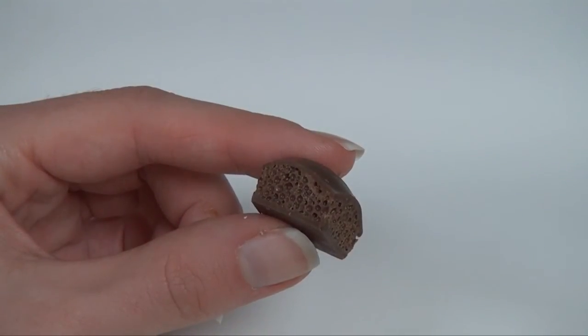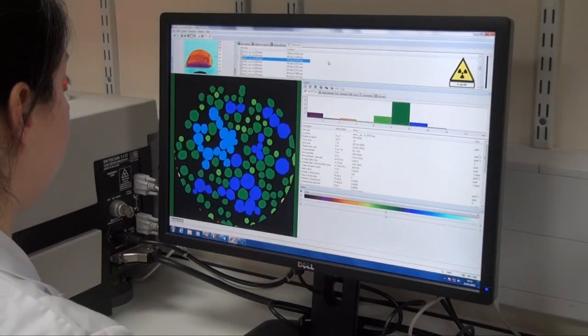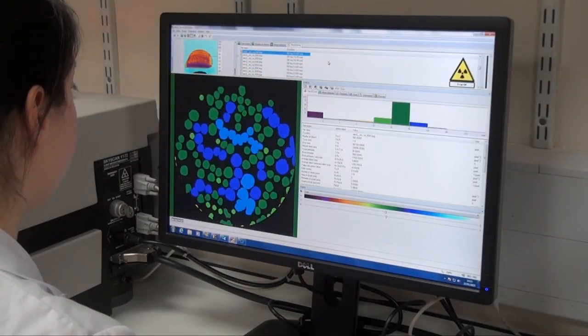Similarly, in the final example, the sizes of bubbles in a piece of aerated chocolate can be measured. These images show measurements for two-dimensional cross sections.